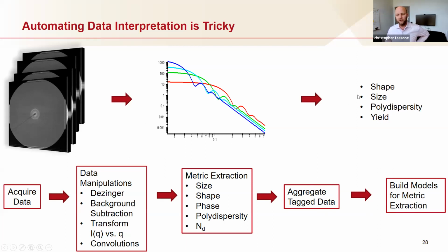And so the flow looks like that is shown up on top. We're essentially taking a 2000 by 2000 dimensional array, integrating it down to some smaller representation of the data, but ultimately we just want to end up with a vector that's maybe 4 or 5 dimensions long.